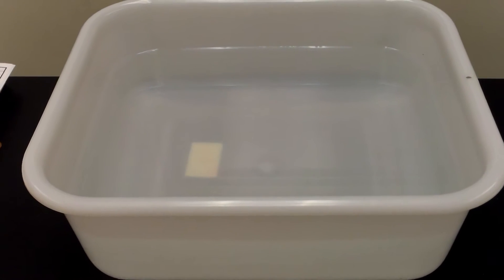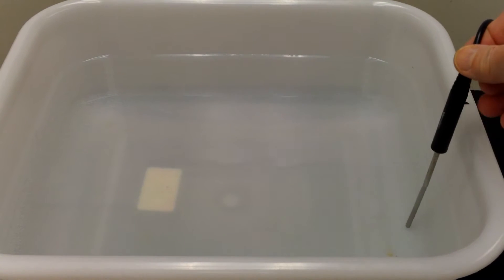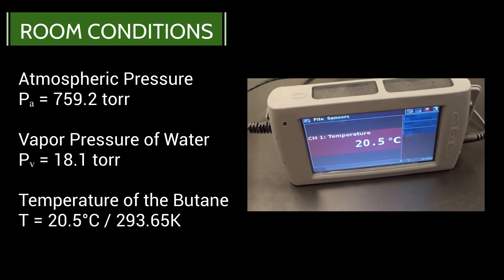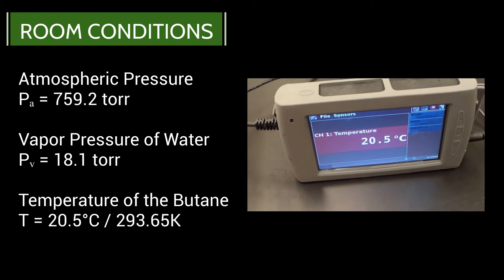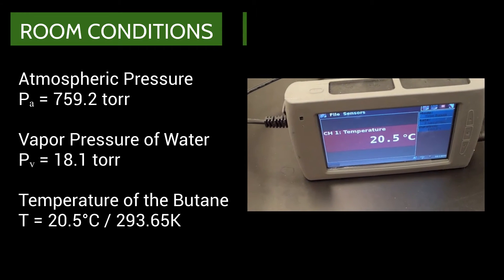This container of water has been sitting out at room temperature for more than 24 hours, so let's measure the water temperature. The temperature of the water is between 20.5 and 20.6 degrees Celsius.